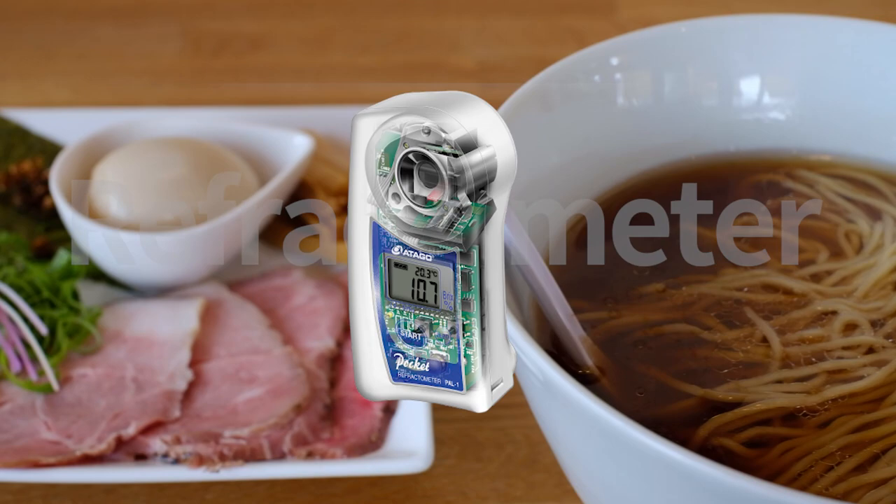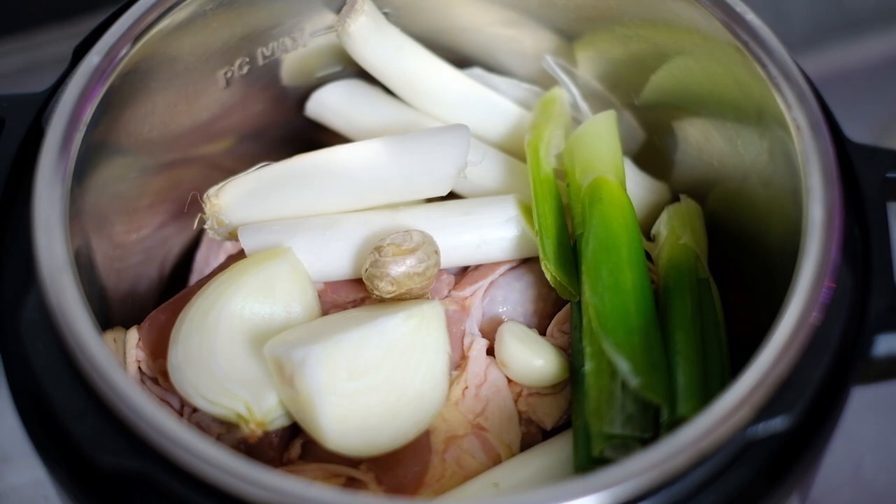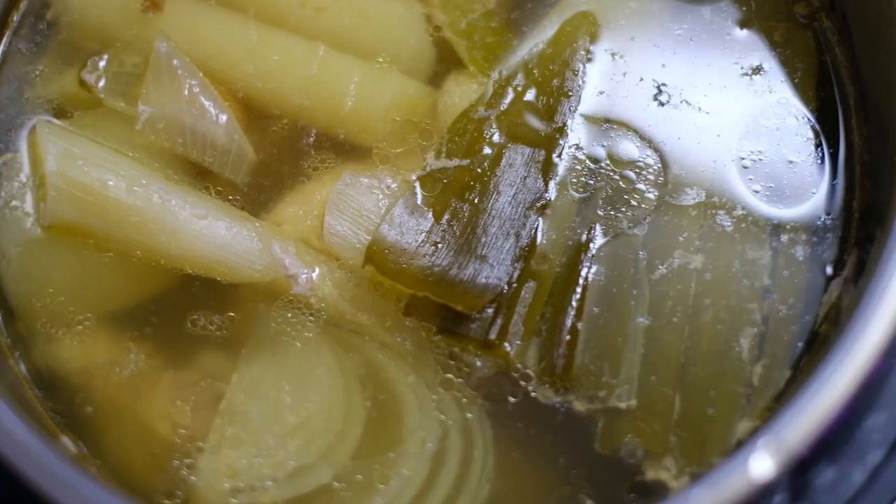That's where a refractometer, which uses light to measure the brix, comes into play. Brix is a measurement of dissolved solids in water — the thickness of the soup. As a soup boils down, the brix generally goes up.